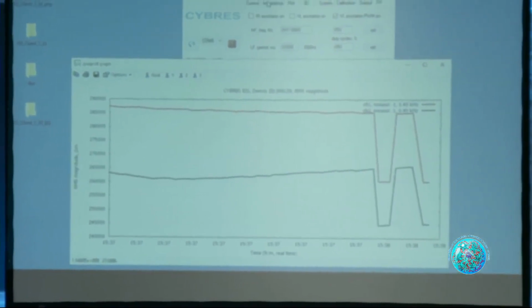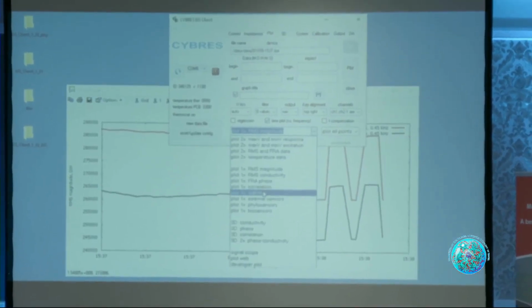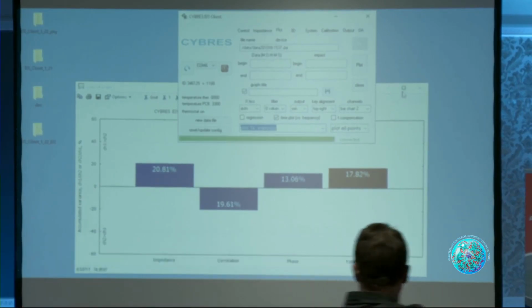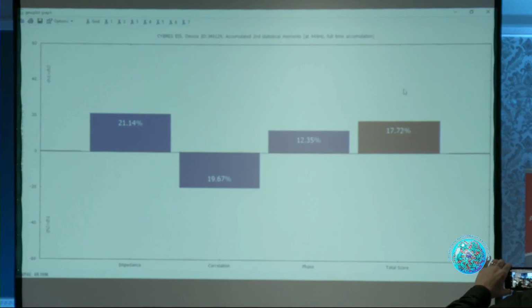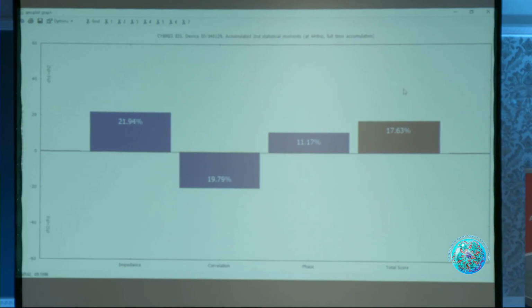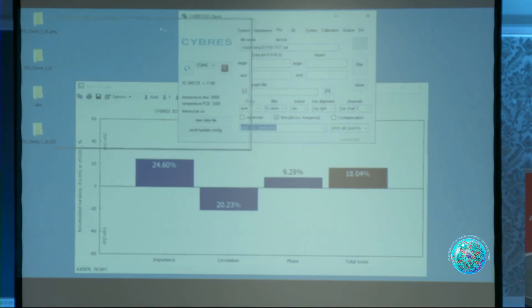And what we will do now, like I show in my talk, we switch to statistics. And now the system is calculating other statistics. Okay, what are parameters of the noise? We don't need to run it a long time. So it's basically 2-3 minutes, it's enough, at least for this demo experiment. Okay, well, where is my client? I think this is enough. We see about, I don't know, 20% roughly.